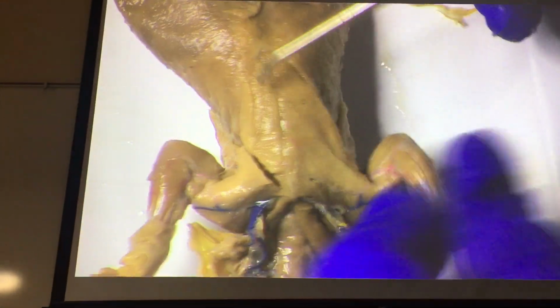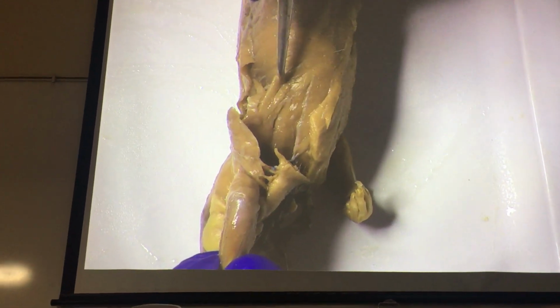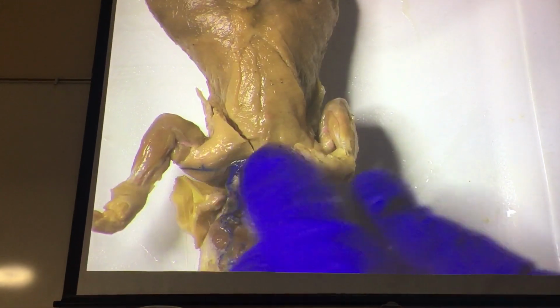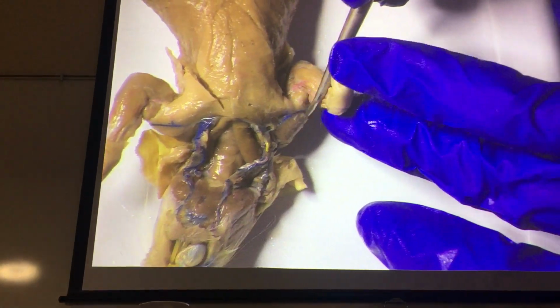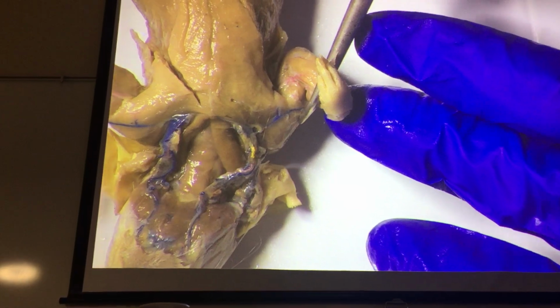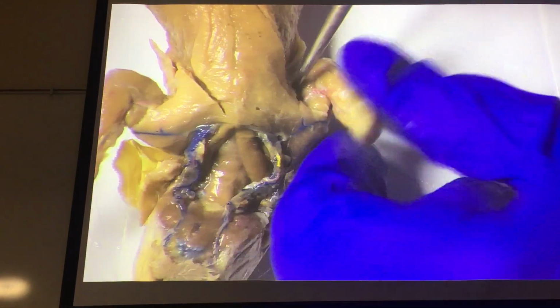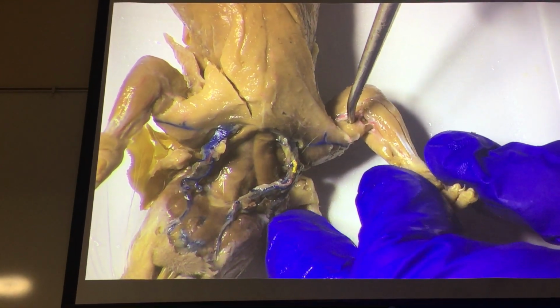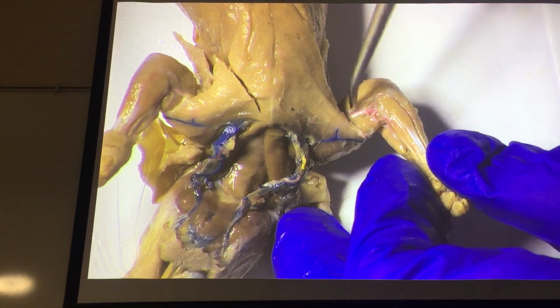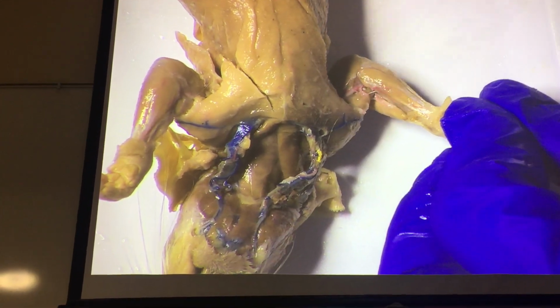Now working on the front here still, we have our pectoralis superficialis, pectoralis profundus, and then here, of course, we have our, well, really not well defined. Let's see if it's better over here. There we go. There's our serratus ventralis. On the arm, we can see here with this blood vessel showing it really nicely, the acromiodeltoid. We can see our nice little round biceps brachii, which is homologous to what muscle in your mud puppy? Very good, the humeral antebrachialis. Here's the epitrochlearis.